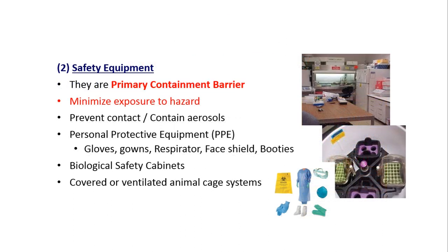The second important aspect of biosafety is safety equipment, also called primary containment barriers. They minimize exposure to hazardous materials and prevent contact with or contain aerosols. PPE — personal protective equipment — includes gloves, gowns, respirators, face shields, booties, and shoe covers. We can also include biosafety cabinets and, in animal facilities, covered or ventilated animal cage systems.